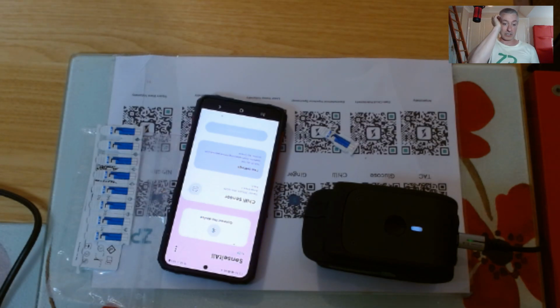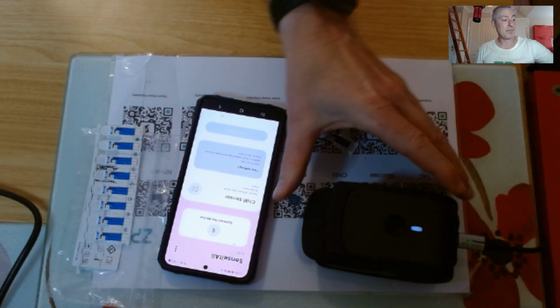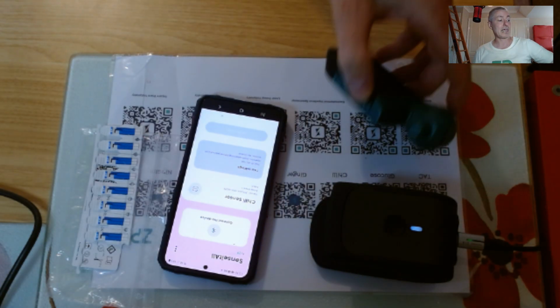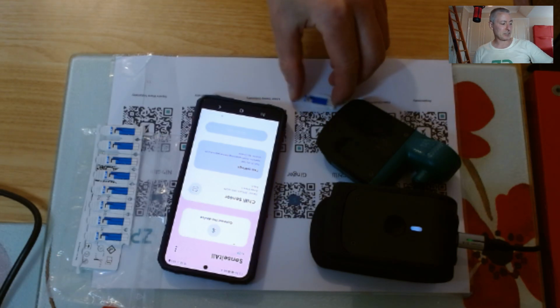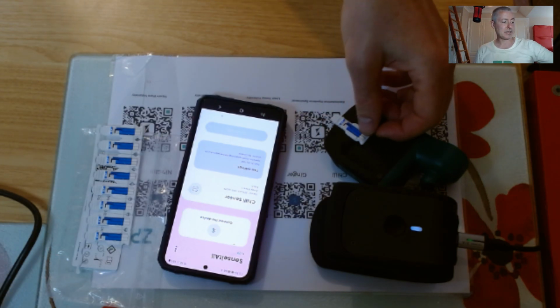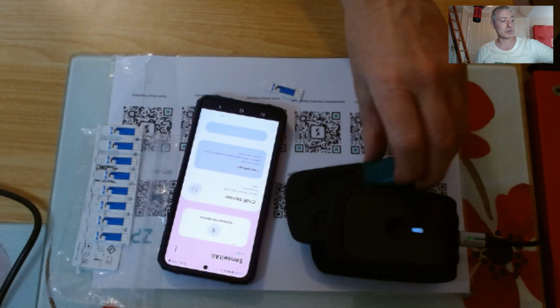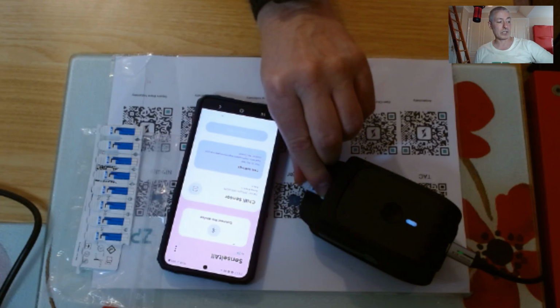The question today is about potentiostats, and I was just saying at Zimmer and Peacock, even though I'm going to talk about an open source potentiostat that somebody's building, or a homemade potentiostat, maybe I should call it that. At ZP we also produce potentiostats as well, but because the questioner is coming in from a high school, I think it's appropriate to support people, so that's what we'll do.